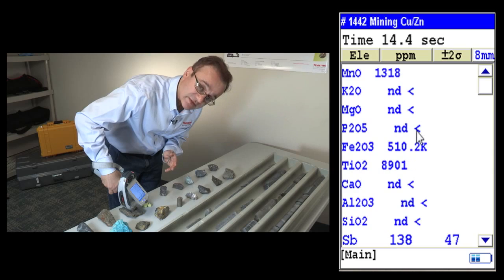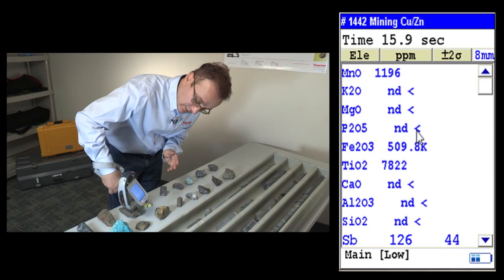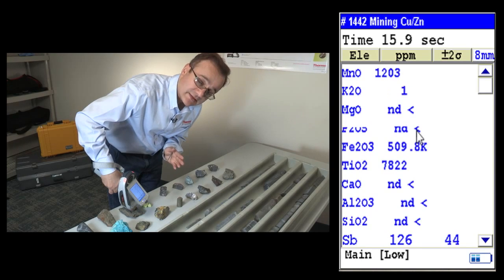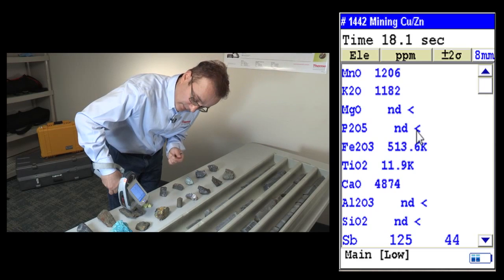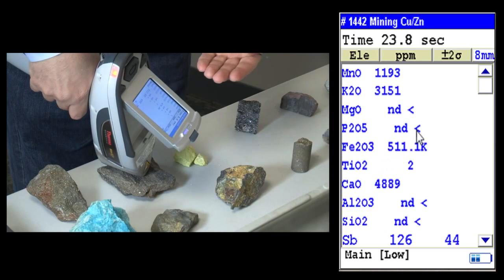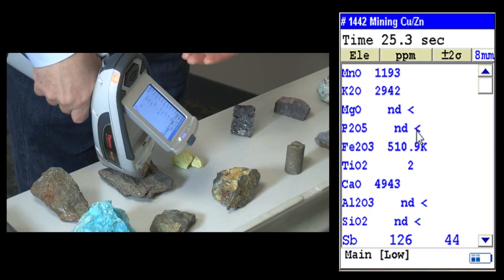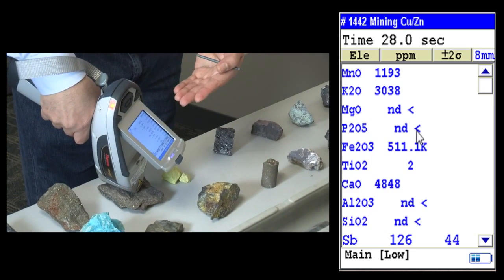The time is set up to 60 seconds. Normally, 30 to 60 seconds is enough to get your assay data. If you're analyzing for light elements, you may need to give a little bit more time.